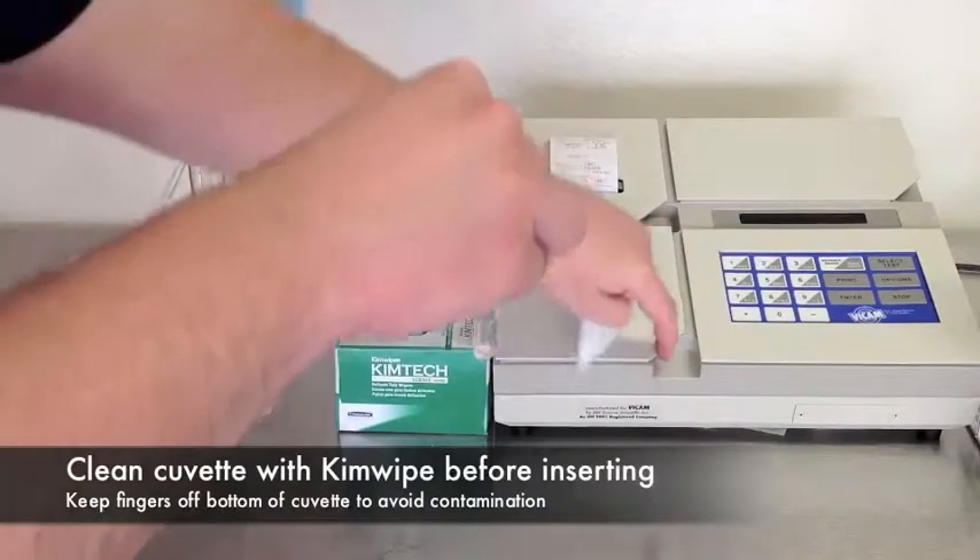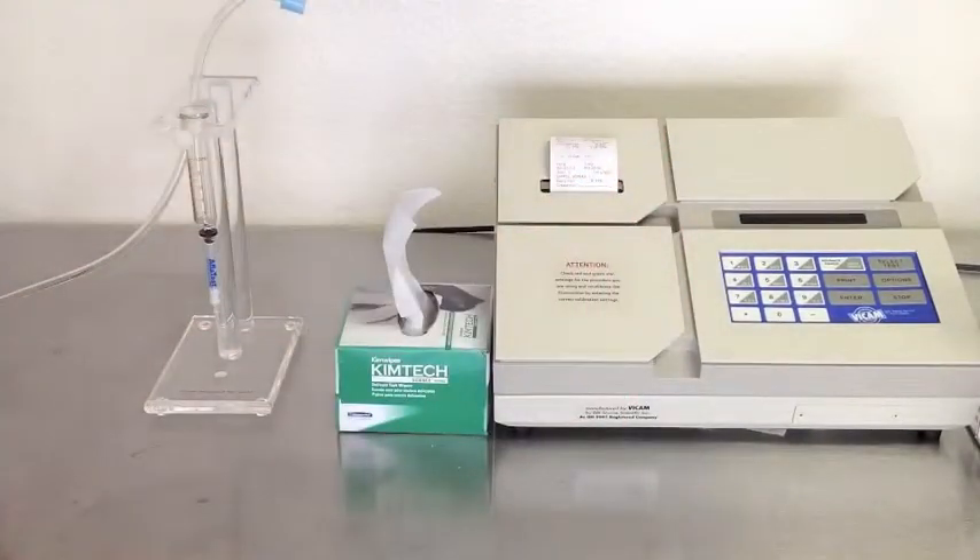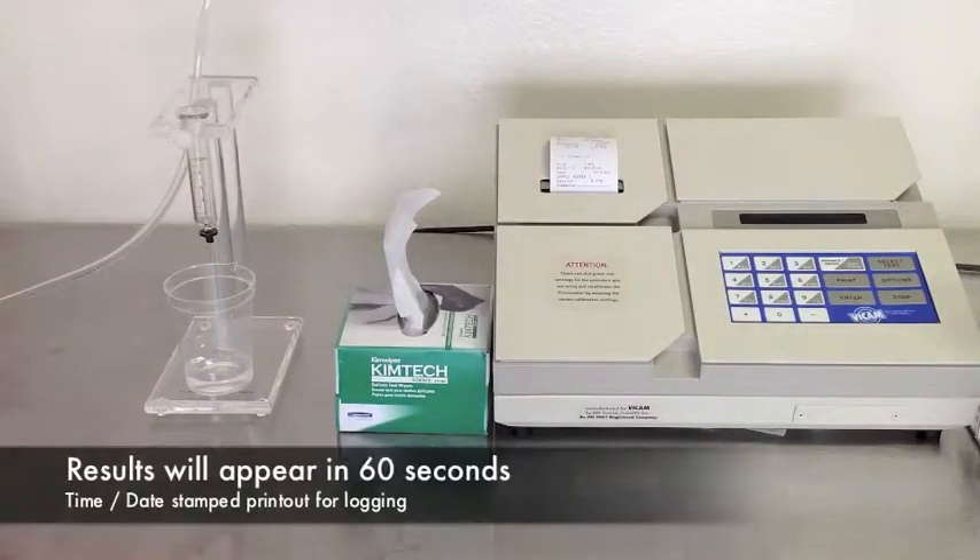Because you checked your calibration settings with the yellow standard, the fluorometer was set up to test for aflatoxin and was waiting for your sample. After 60 seconds, your results will print and appear on the screen. Remove the sample and you're ready for the next test.